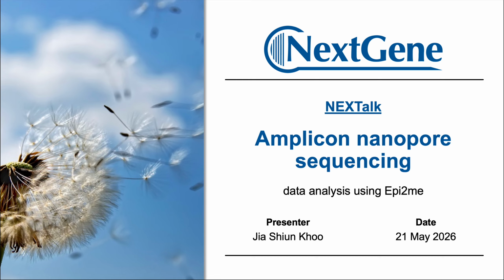Another question from Joyce is whether EPI2ME has KEGG annotation for WGS. Back to the questions regarding the KEGG: the one in EPI2ME for whole genome sequencing only has the structural or genome annotation, identifying where the genes are located in the genome, but it does not have very detailed functional annotation, especially KEGG.